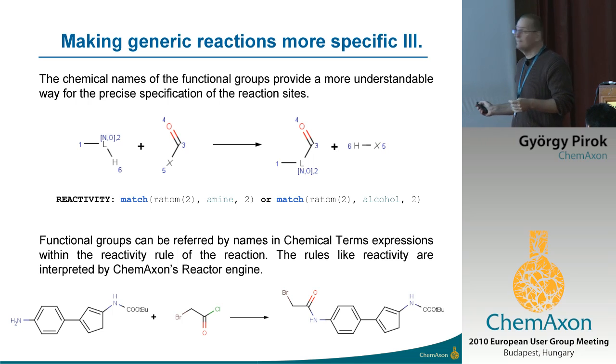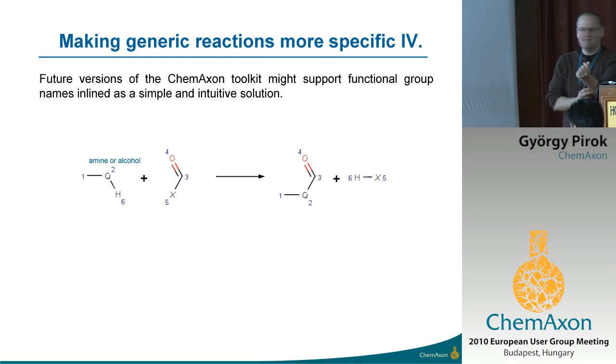So this is probably a bit simpler than SMARTS. I'm not saying that it's intuitive. You have to understand the rules and you have to learn how to formulate these things in chemical terms. But it works as well. We will get only the expected acylation.